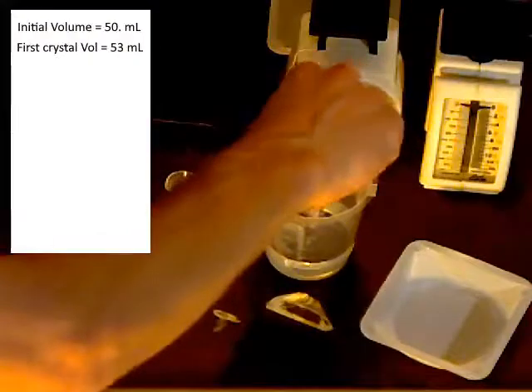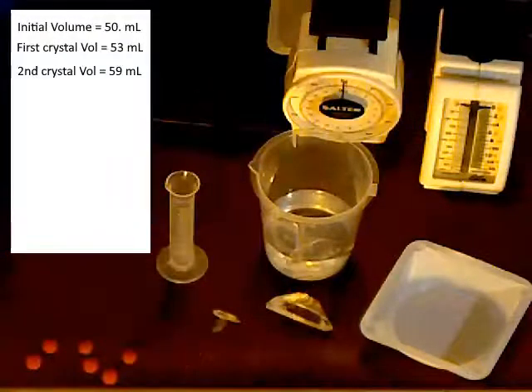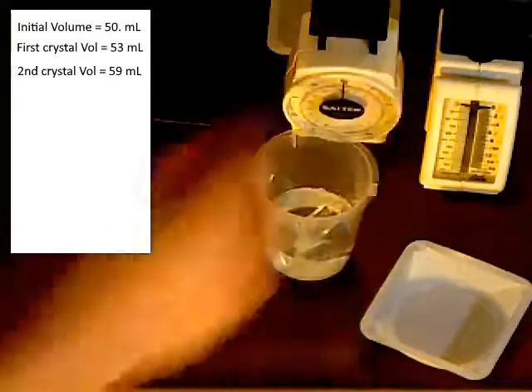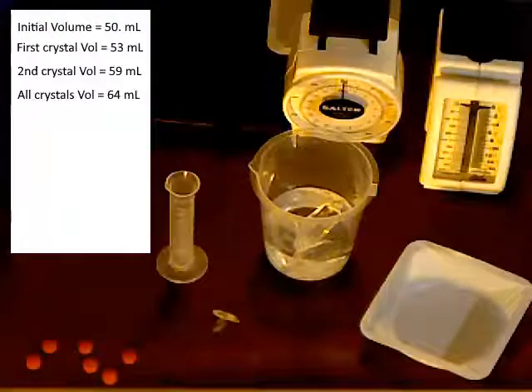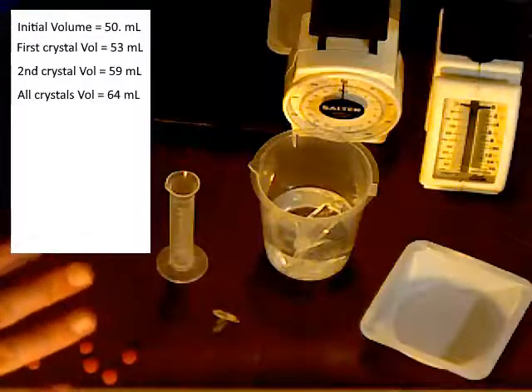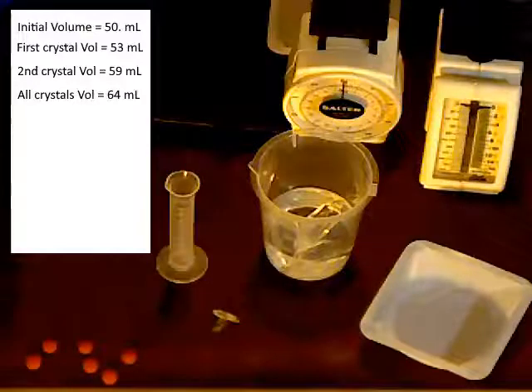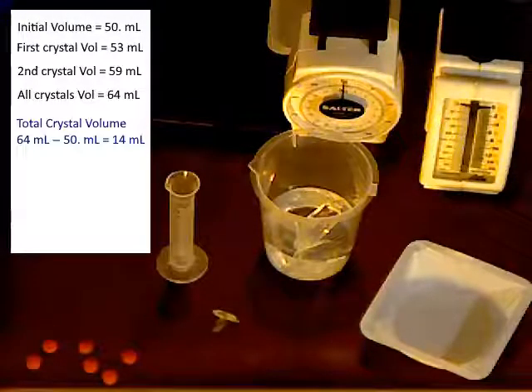I can add another one. Volume goes up further. And I'm going to add the last one. And the volume goes up even more. I am careful to make note of the volume before I put in the crystals and also the volume afterwards. And I'm careful to make sure the crystals are fully below the surface of the water so I get the full volume.